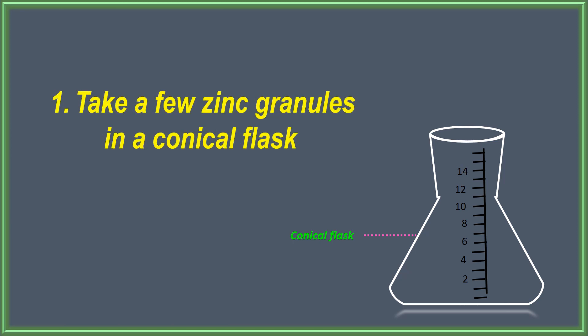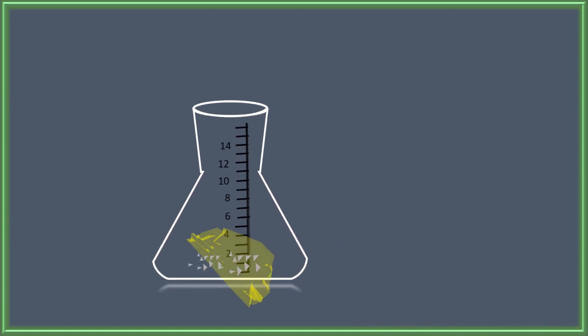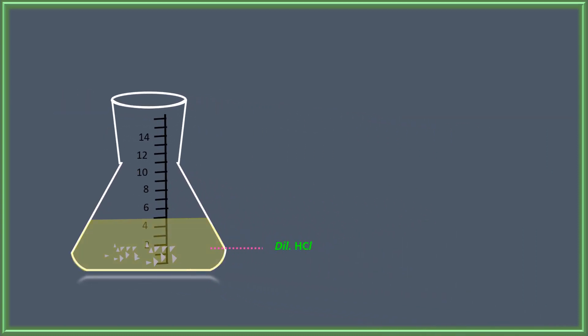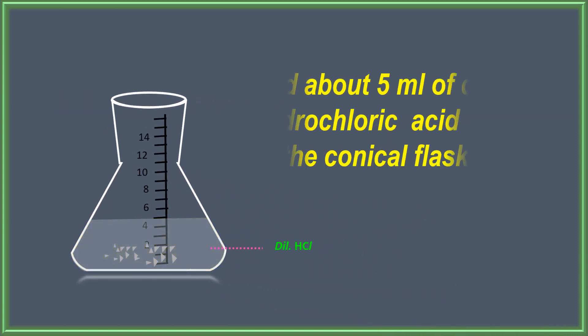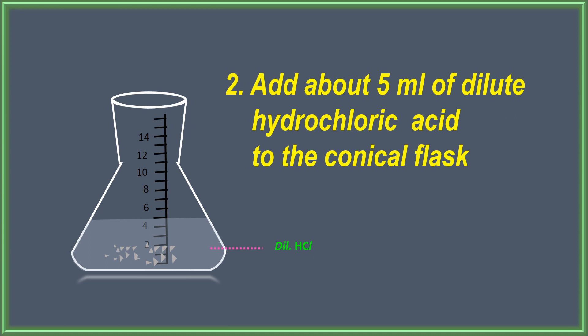Conical flask. Take a few zinc granules in a conical flask. Zinc granules, dilute HCl. Add about 5 ml of dilute HCl to the conical flask.